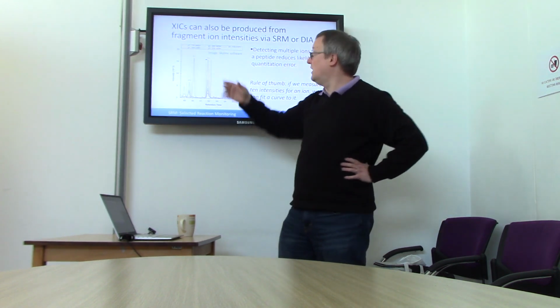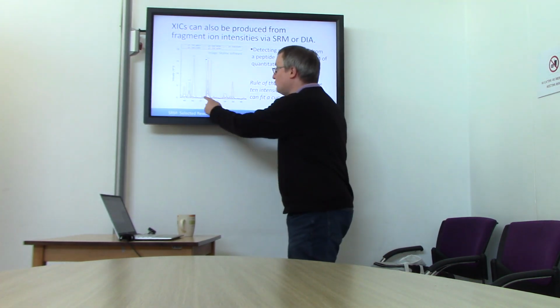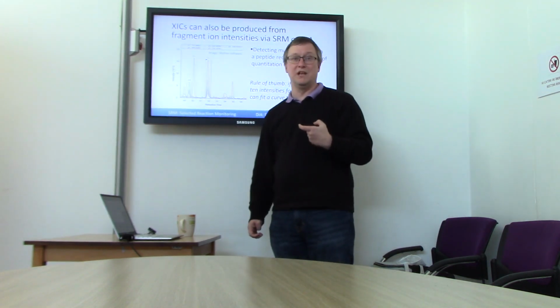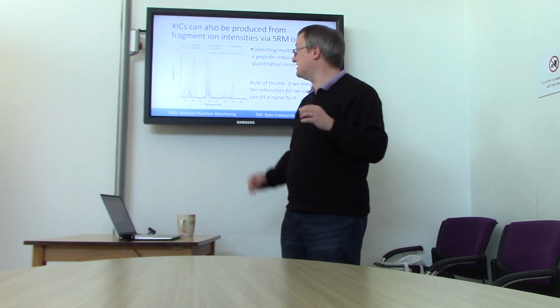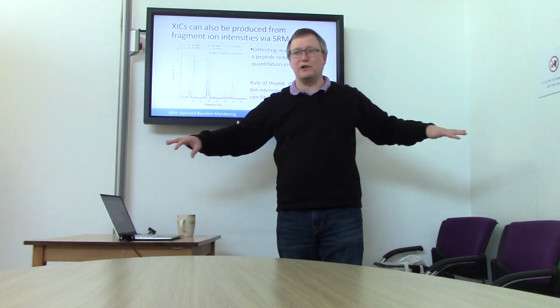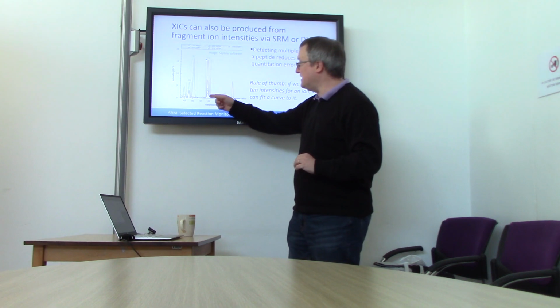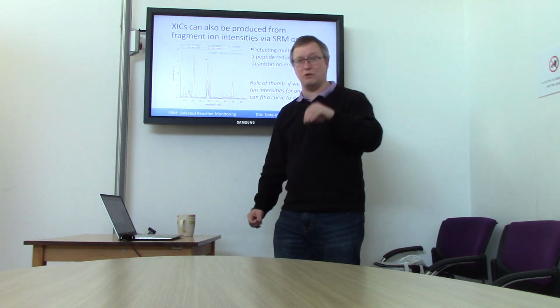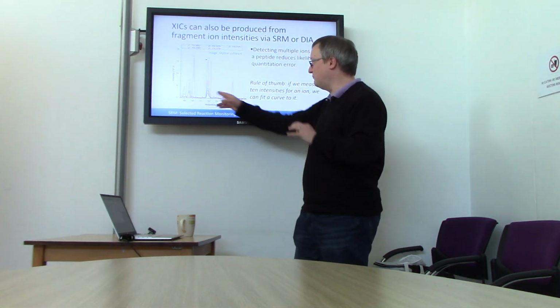All 5 of these Y ions associated with this particular peptide are all rising and falling together at a common retention time. This gives us the ability to quantify this peptide much more accurately because it's possible that we would just have a rise and fall in some random part of the retention time that doesn't have anything to do with this peptide. So by playing these signals off of each other, by recognizing that all of these fragments attributable to this peptide are rising and falling together, we have a better chance of pinning this down.